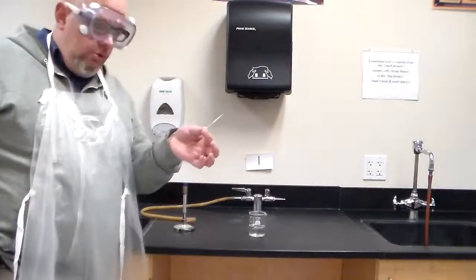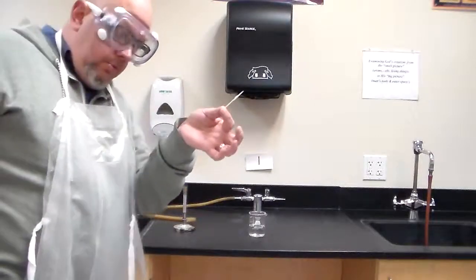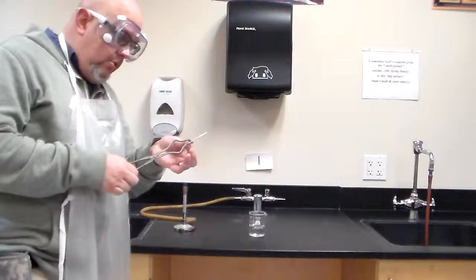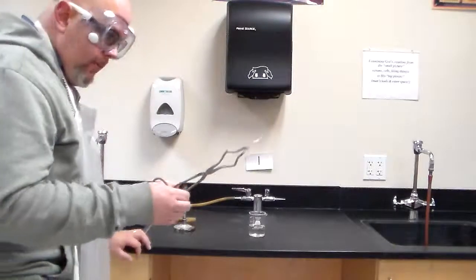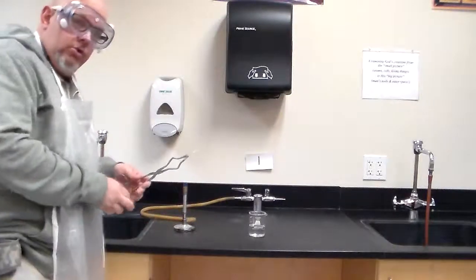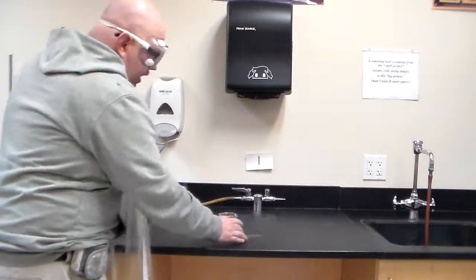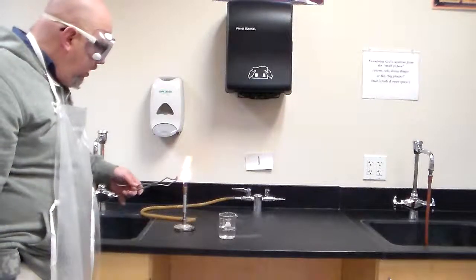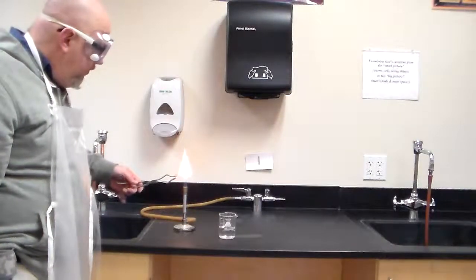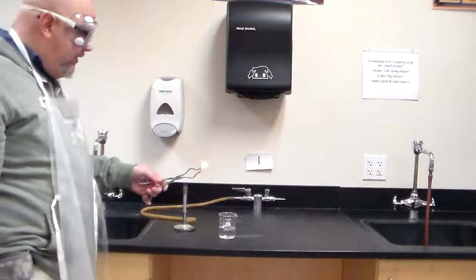So this is our whatever. And what's going to happen, you're going to get one of these and you're going to use the tongs. You're not going to touch the toothpick with your fingers because it will be soaked in the solution. So you're going to get the toothpick like this, okay? And what you're going to do, you're going to run it over and position that there. And you're going to observe to see if there are any colors that it gives off. And whoa, okay, so this is probably a clue that it's done.